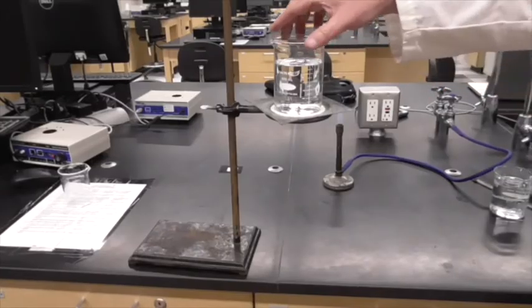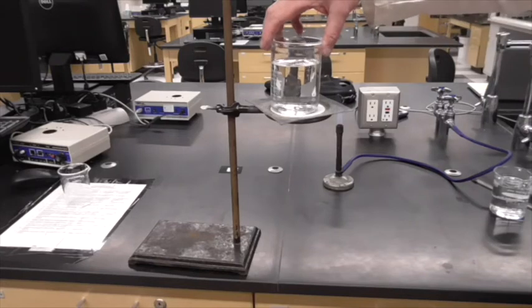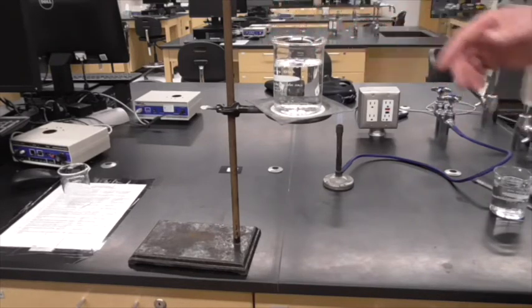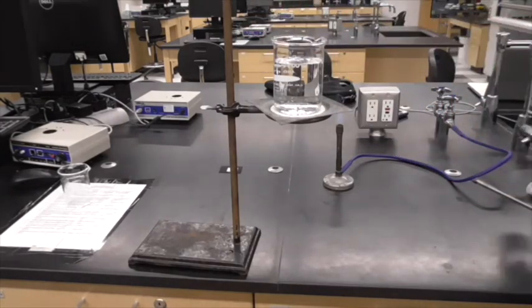Okay, so we're going to do our freezing point of paradichlorobenzene first. We have to do 2 trials. Basically, what it tells us to do is take about 300 milliliters of distilled water in a 400 milliliter beaker, and we're going to heat this. I'm going to add a little bit more water to get it to about 300. And we're going to heat this to about 40 degrees.